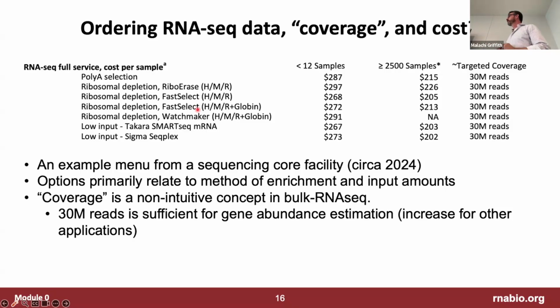Another question. Speaking to replicates within cell line type experiments where you extract your entire sample, so you have a whole plate, you extract all of the RNA. Is there a need for, at that point, submitting replicates of the library prep? Because it would be the exact same RNA extraction going into 2 vials versus 1.